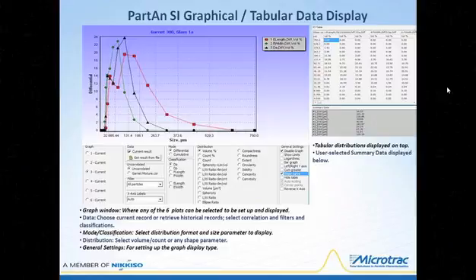The current record or set of historical records can be selected along with any correlations, filters, or classifications. The distribution type can then be chosen: volume, count or number, or any shape parameter. Last, the general graph settings can be selected. In the upper right, the tabular distributions are shown, and below, up to 45 different pieces of summary data for all six parameters can be selected by the user to be displayed.